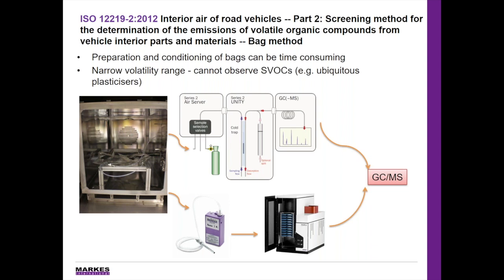First, it's from the very nature of the bag. There are plasticizers used in this bag, and you have to make sure that you're using non-emitting bags. Second, you also want to make sure the mixing of the air inside the bag is uniform so that you are getting the real VOC concentrations. Third, the preparation and the conditioning of the bag can also be very time-consuming.